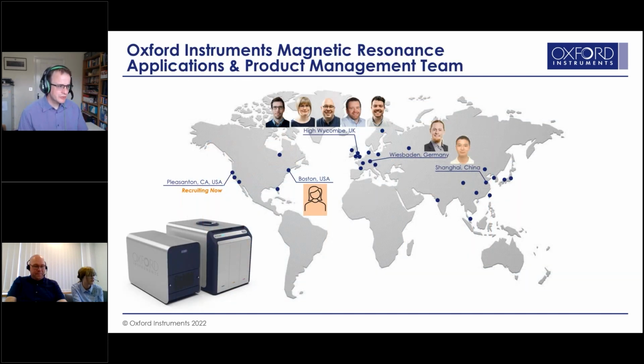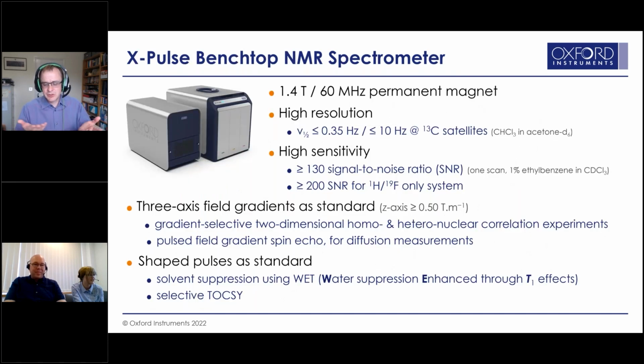We've got quite a few questions coming in about the mechanics of the machine. Can you give us a bit of an idea about the temperature range of experiments that you can run on the machine, and the sensitivity, and what kinds of special spectra you can run, like correlation spectroscopy, some of the more specialist experiments that Claire was talking about? We went through a fair number of combinations.